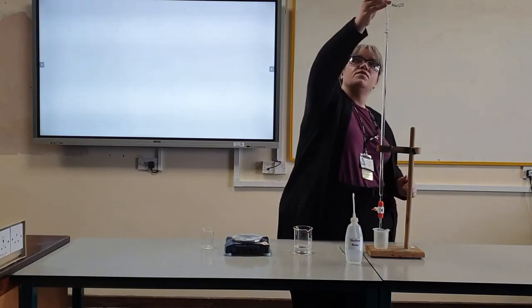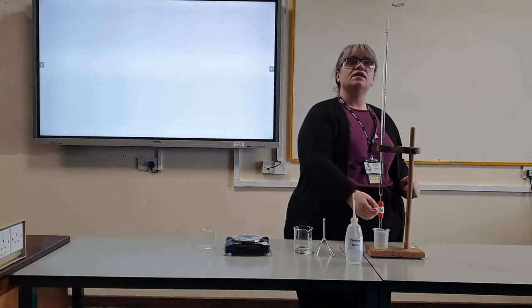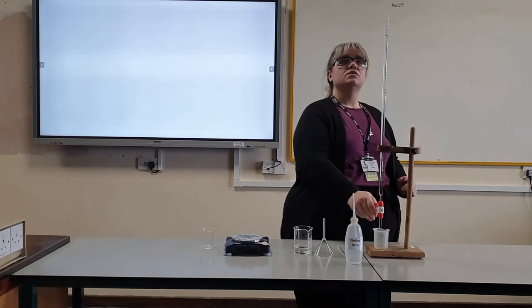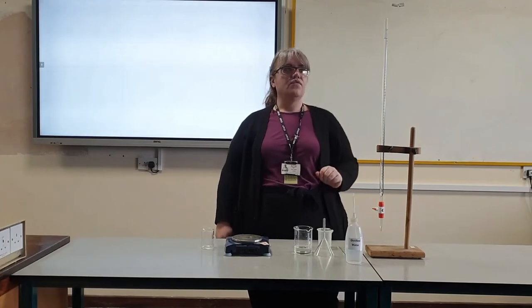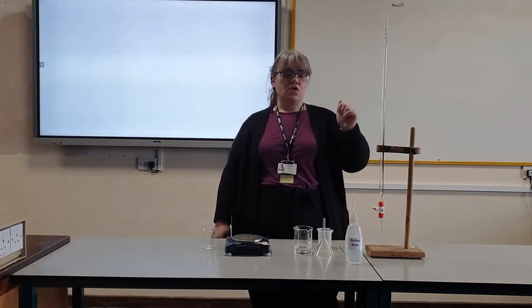Remove the funnel. Then I will slowly let out the water until the meniscus sits on the zero mark. When the meniscus is sitting at the zero mark, I will leave it for five minutes to make sure that there are no air bubbles that have escaped and there's no leaking.